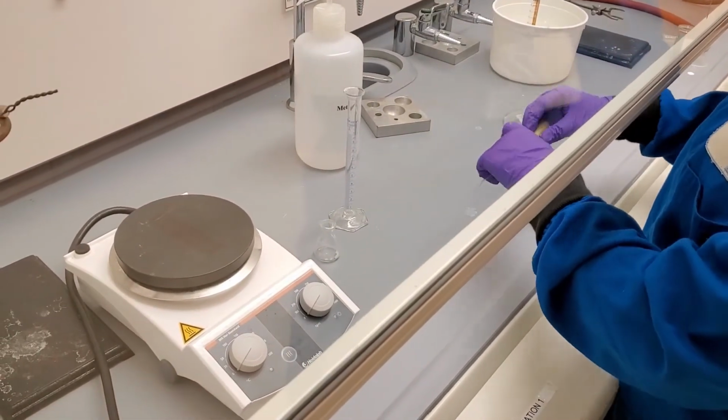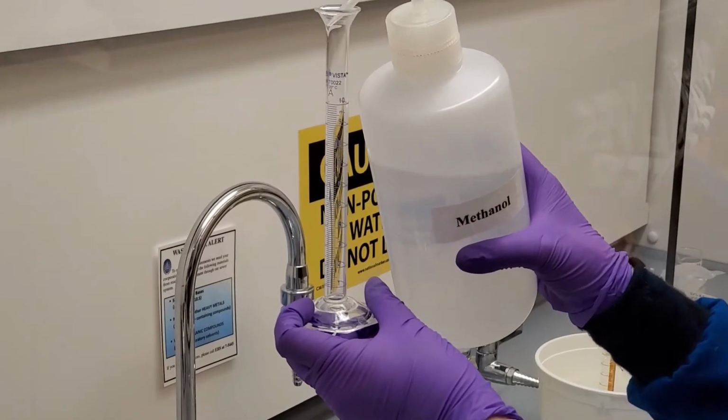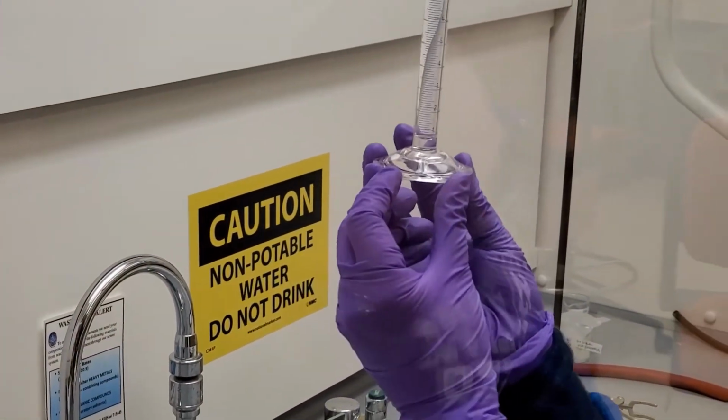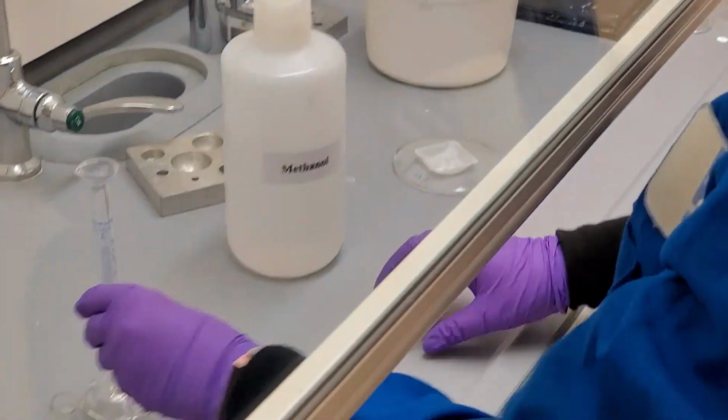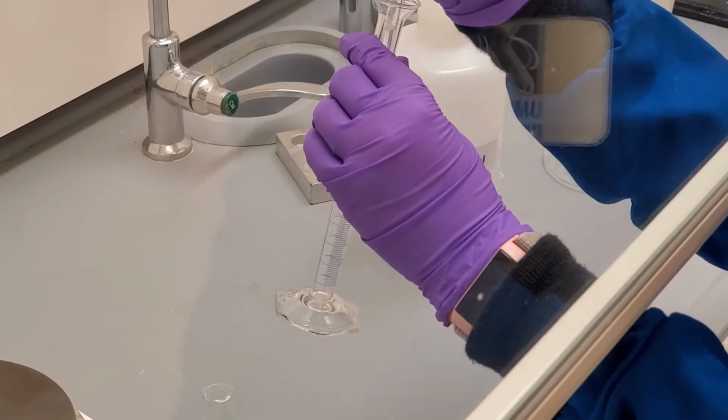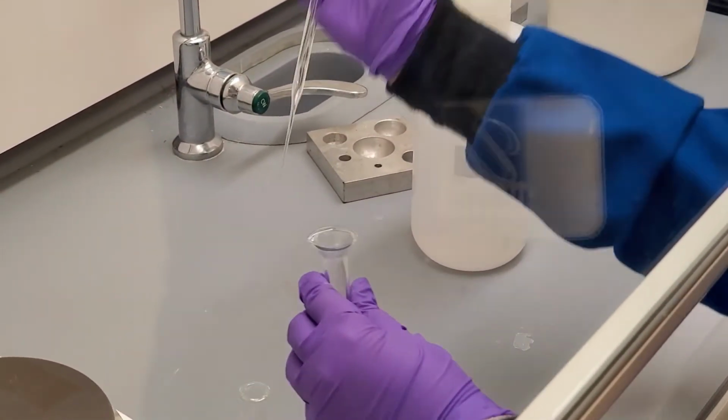We bring our solid materials to the hood so that we can prepare the reaction vial and start our reaction. We measure out 0.5 milliliters of methanol in the graduated cylinder. We use a Pasteur pipette to transfer the solvent to the reaction vial. We swirl the mixture to dissolve the camphor.